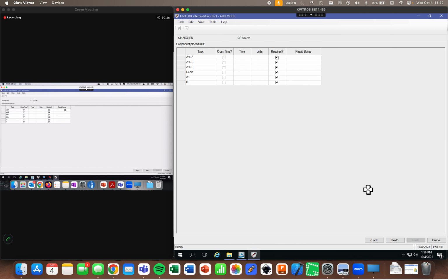We're going to mark all of these as required. That would be important. And then we're going to set all of these result statuses to performed. Sadly, we don't have like an apply to all, so you just have to select them one at a time.